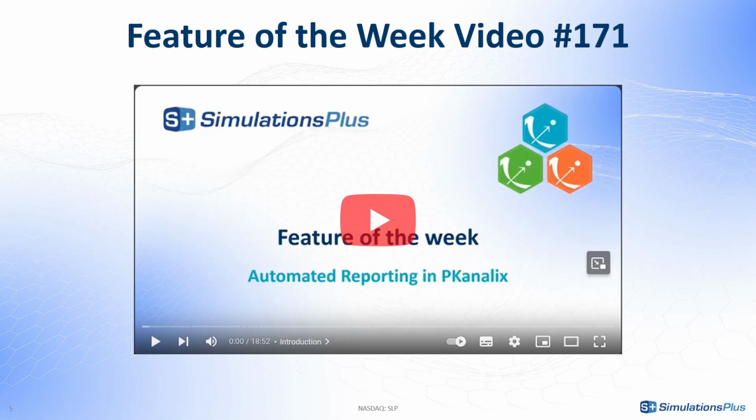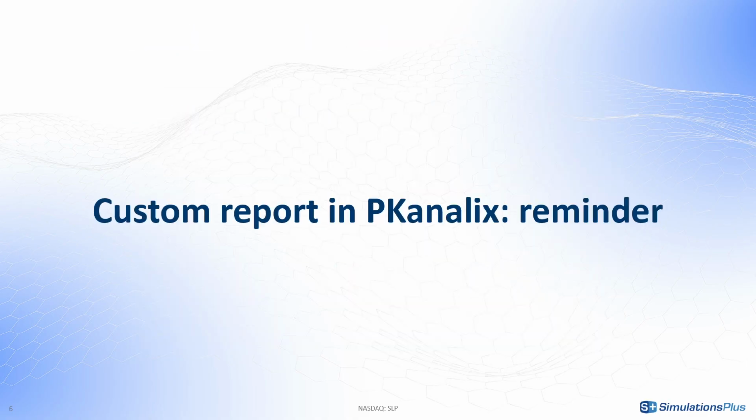In the previous video, we explained how to generate a report in PKanalix, how to build a report template, and we gave you some basic examples to write placeholders. So let's start with a quick recap of how to create a custom report in PKanalix.